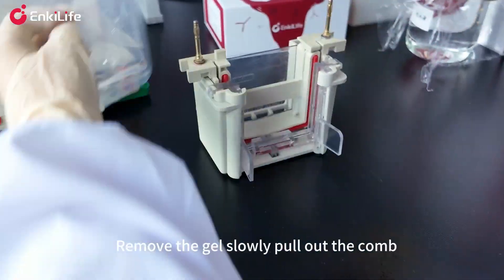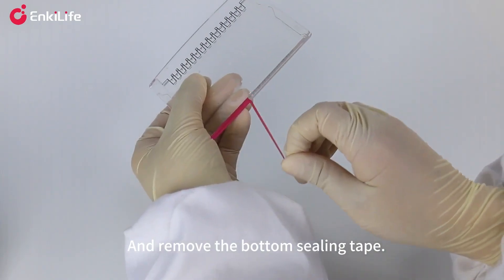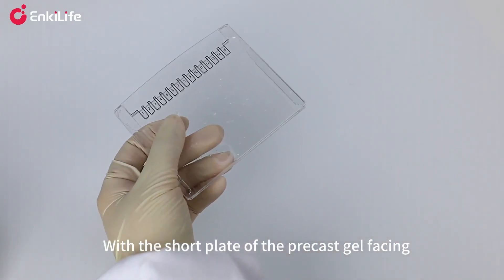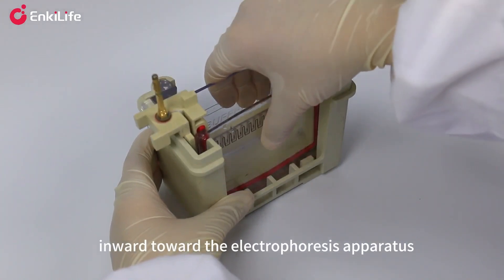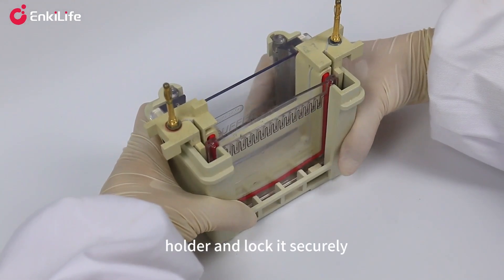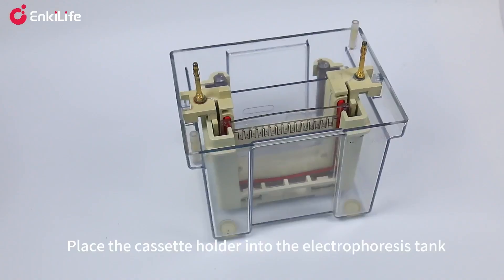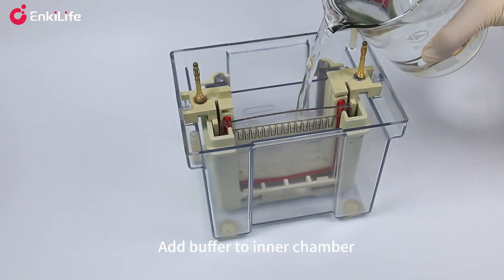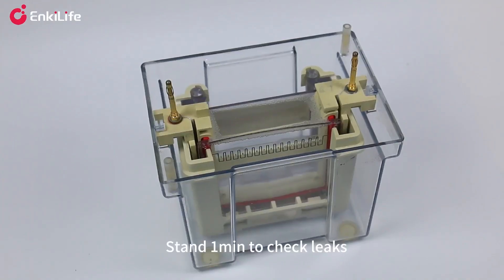Tear open the precast gel package, remove the gel, slowly pull out the comb, and remove the bottom sealing tape. With the short plate of the precast gel facing inward toward the electrophoresis apparatus, insert the gel into the cassette holder and lock it securely. Place the cassette holder into the electrophoresis tank and add buffer to the inner chamber until submerging the wells.